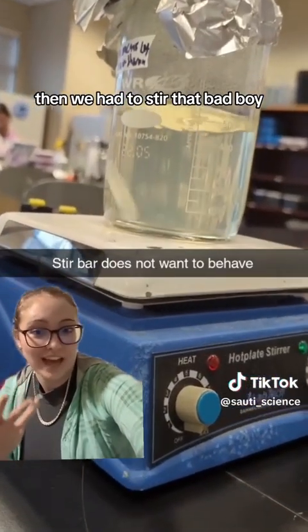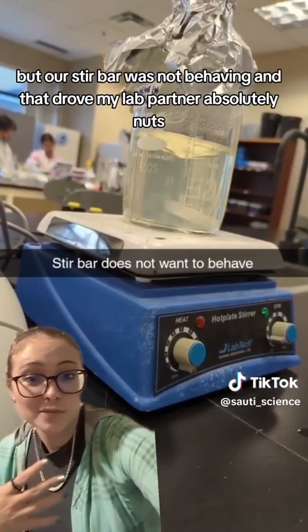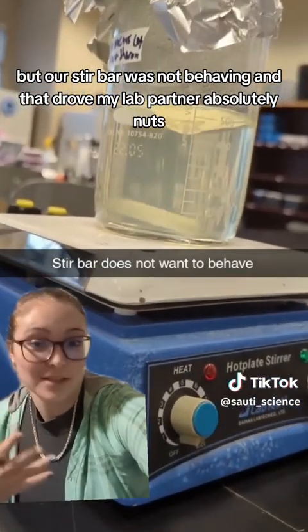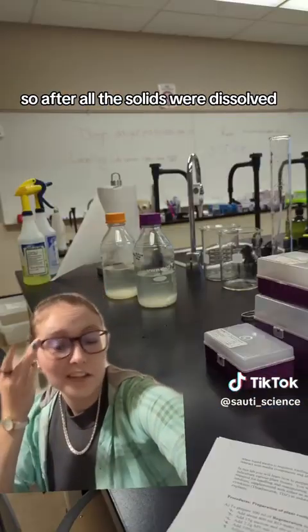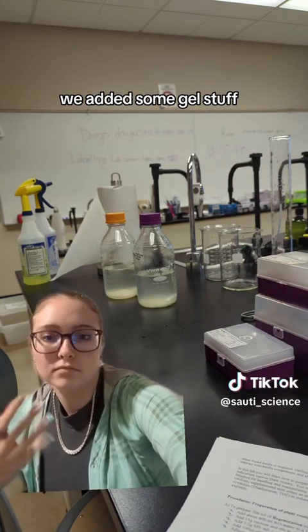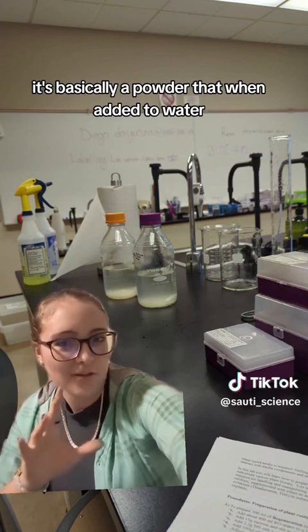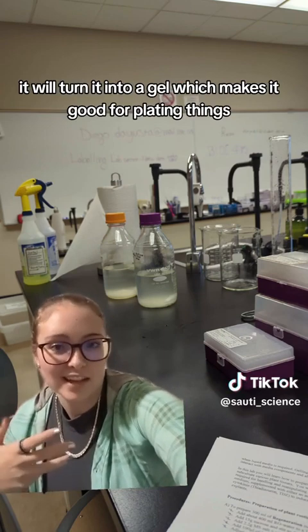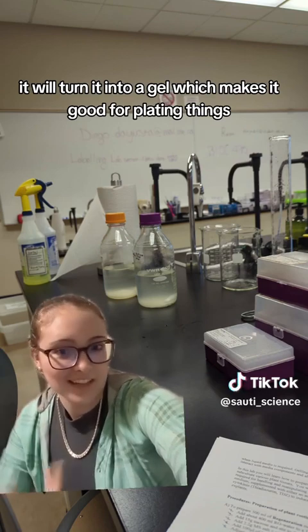Then we had to stir it, but our stir bar was not behaving, and that drove my lab partner absolutely nuts. After all the solids were dissolved, we added some gel stuff — basically a powder that when added to water turns it into a gel, which makes it good for plating things.